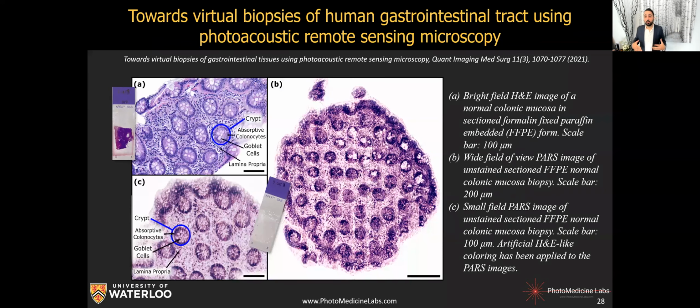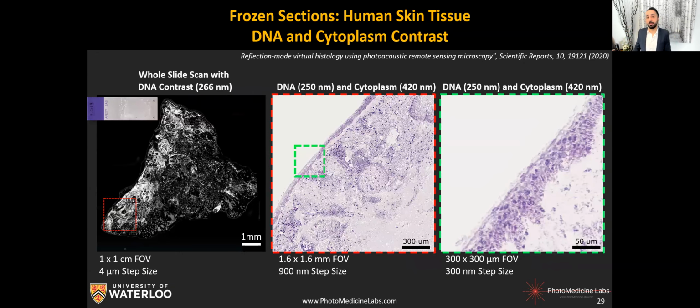Before I move on, I'd like to mention again that we can now build an endoscopy method to do virtual biopsy, to take it to body cavities and, hopefully, get H&E images in real time. So we also did work here to look at gastroenterological samples and test our system to see how it works on GI samples.